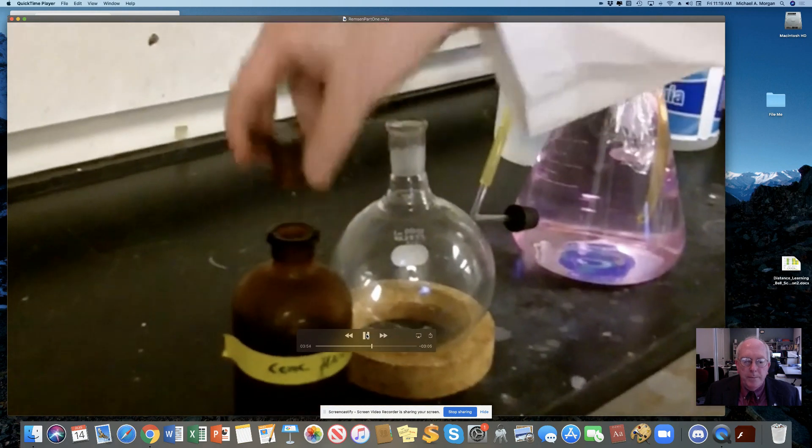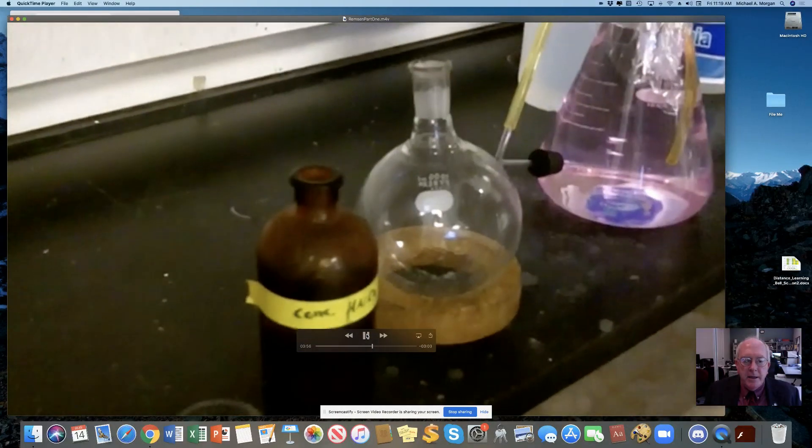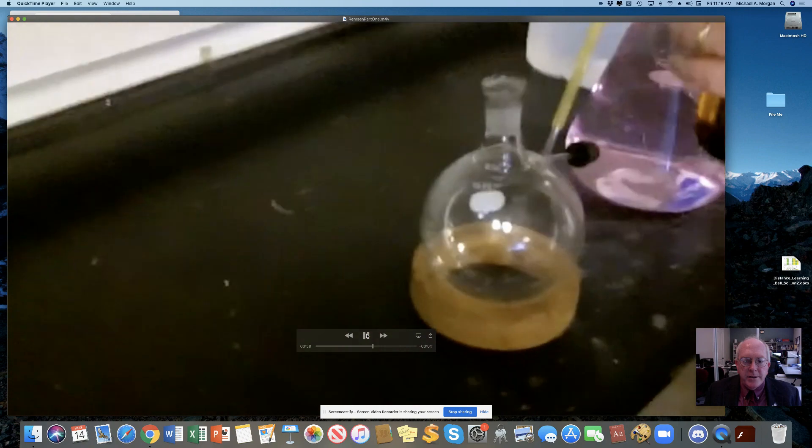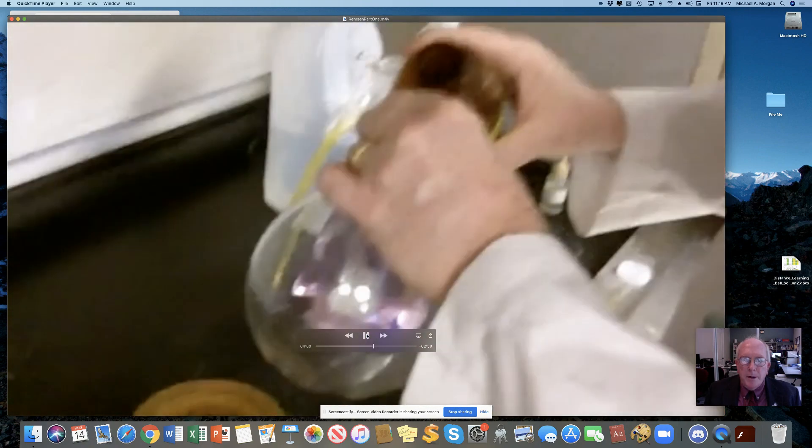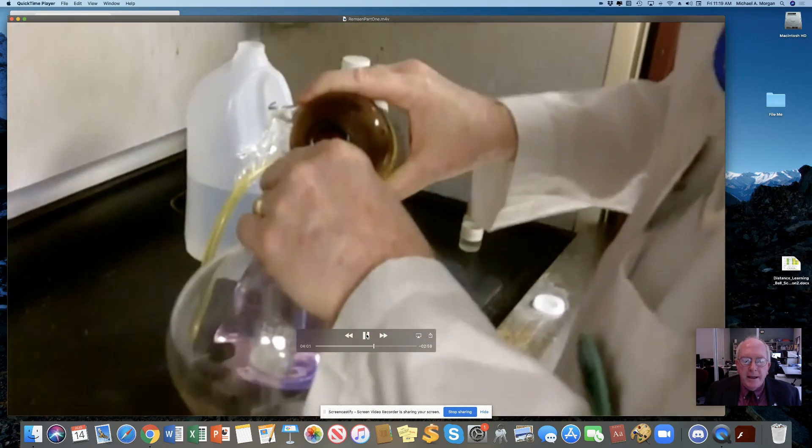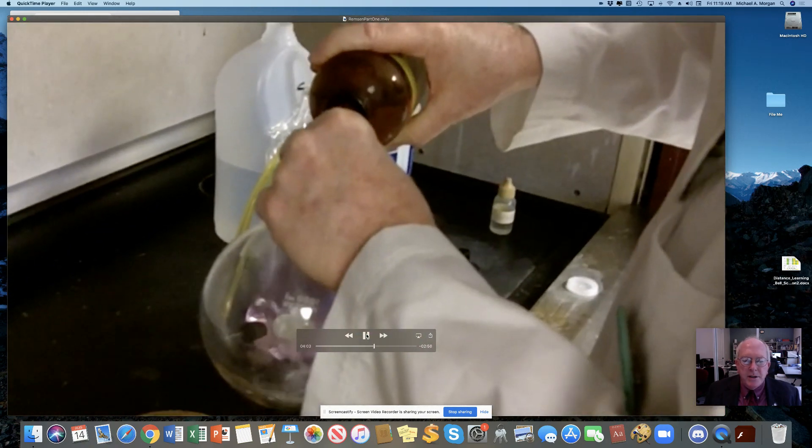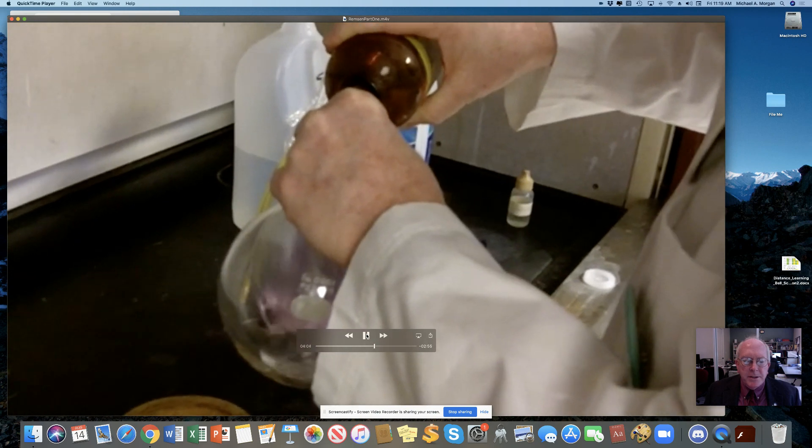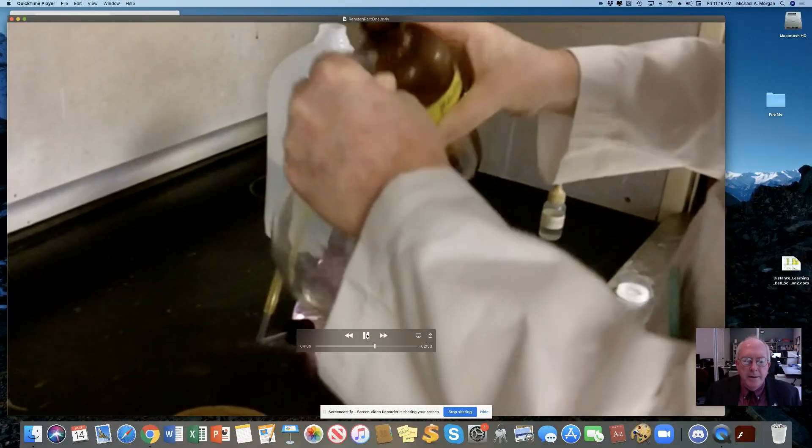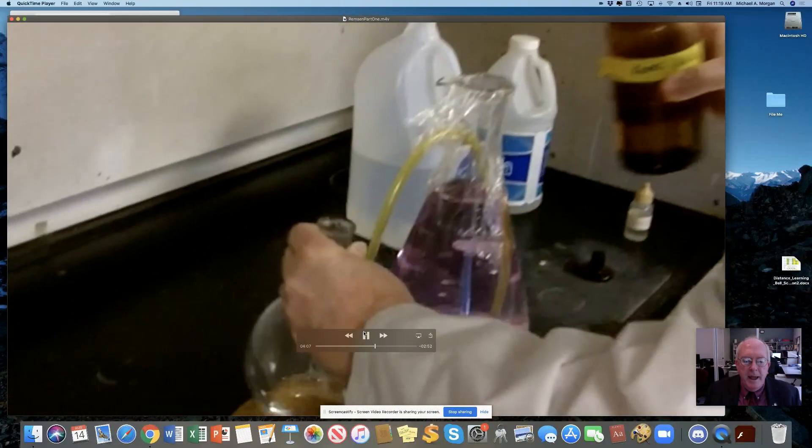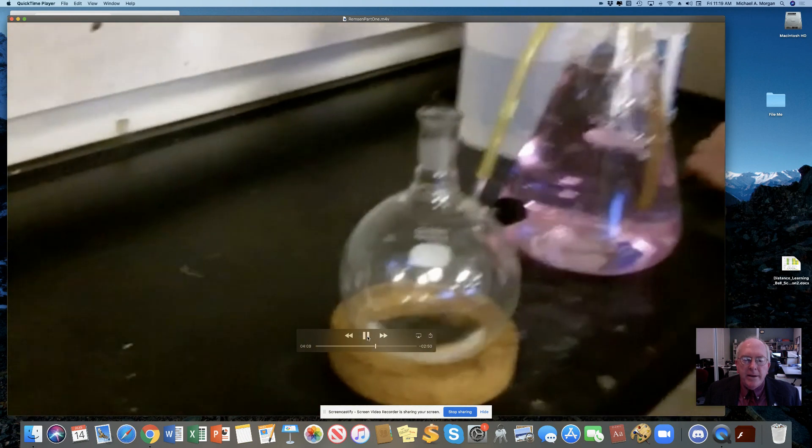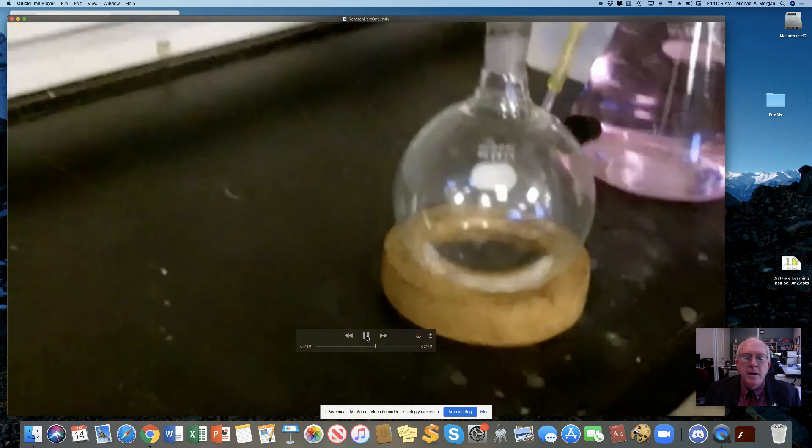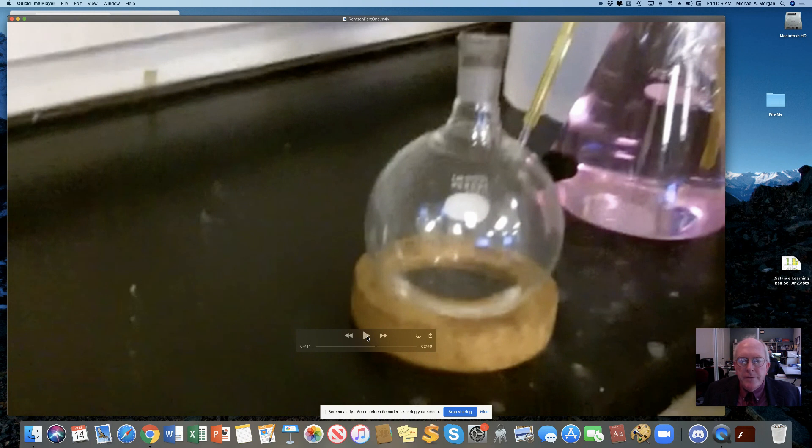I'm going to take some of this concentrated nitric acid, I'm going to add it into the flask, not any predetermined amount, just some. And then we're going to add the pennies in on that. Now, before we get that going, let me read you the first part of the script, the story of Ira Remsen.